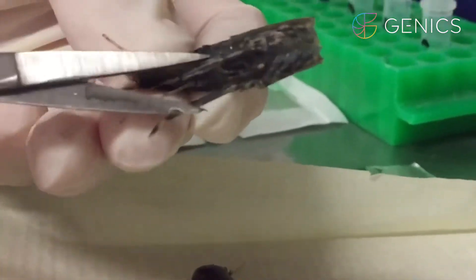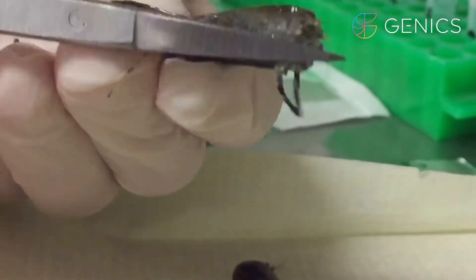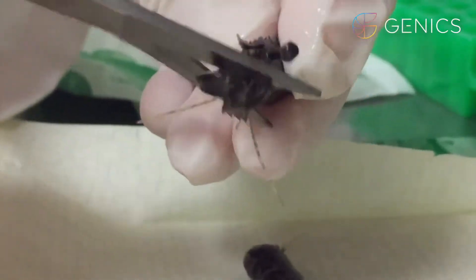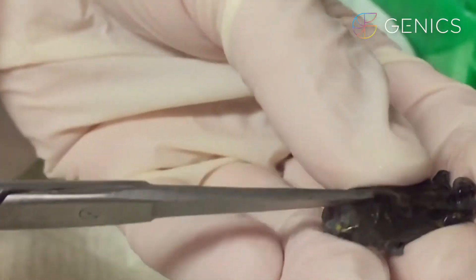Next, we take our headpiece and cut off the periopods and trim those right back. We then trim the face parts and cut back onto the rostrum.